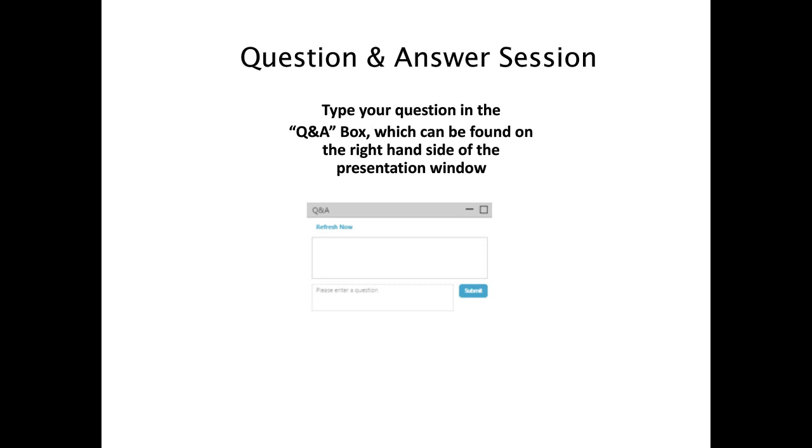Great. Here's a related question. What about ID? How do I know if the internal diameter I choose for the Halo column will work with my instrument? So first, you would need to know the dispersion of your instrument, and that would need to be measured. If you have an instrument with low dispersion, then you'd be able to use 2.1, 3.0, or 4.6 millimeter ID columns without having to worry about loss of performance. But if you have a legacy HPLC with a lot of dispersion, and you're not able to optimize it, you might not want to use a 2.1 millimeter ID column.